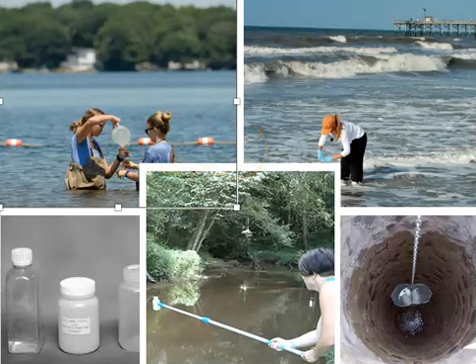These are the kinds of places that have to be monitored frequently, especially during the summer months, to ensure that there are no microbes growing at dangerous levels in the area where people are swimming. So you can see that they're pouring a sample that they've taken into another plastic container in order to take it to the lab. And again, in a swimming area like this, they would not take one sample. They would travel to select spots within the swimming area and collect several samples.